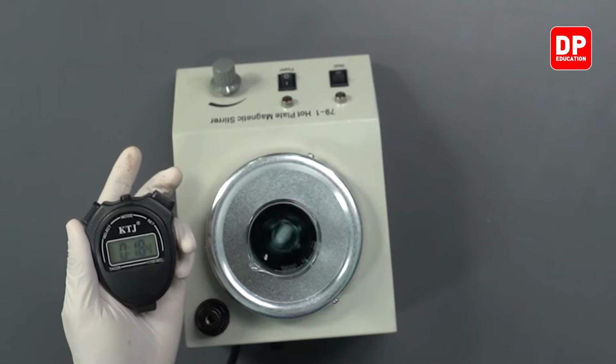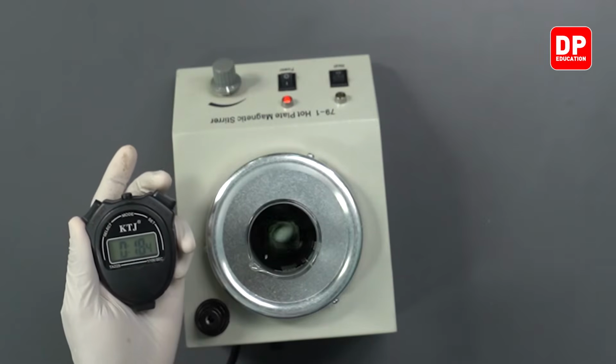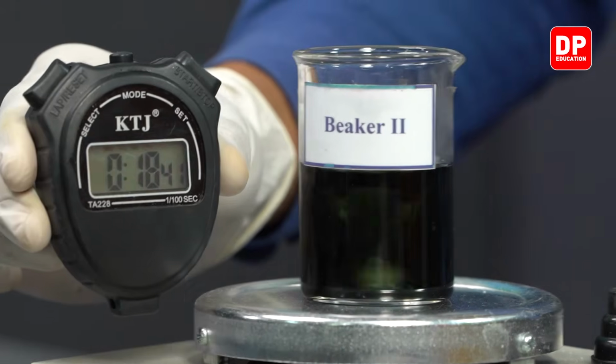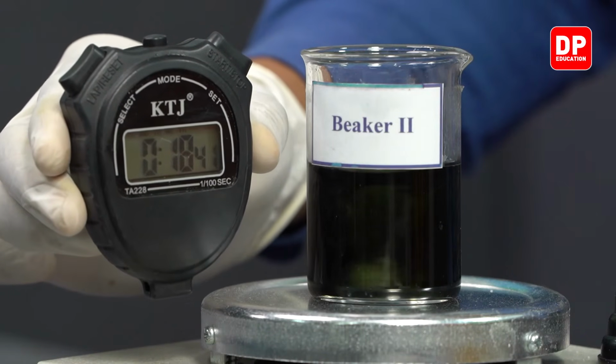So the color change was obtained at 18.41 seconds.